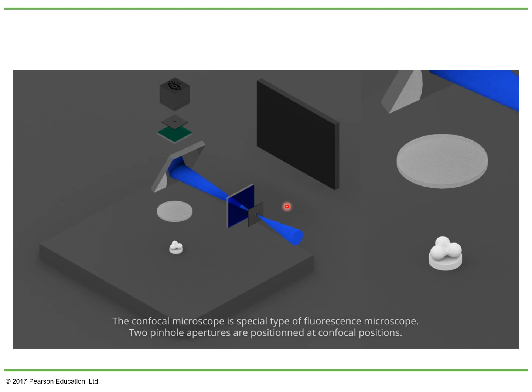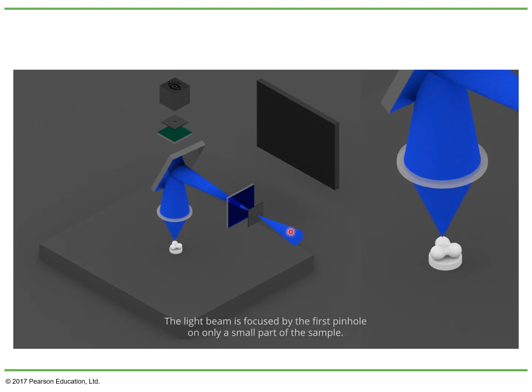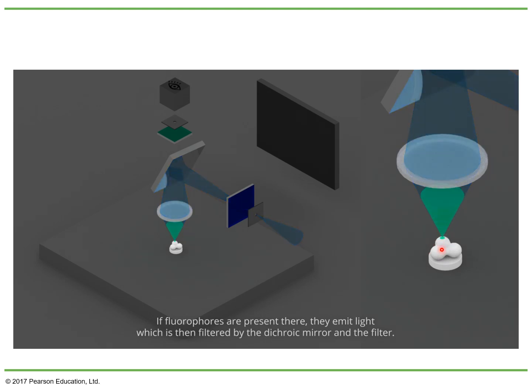A confocal microscope is slightly different. Although it will have a laser, it will have different filters and different pinholes, so you don't illuminate the entire sample, you illuminate only a section. You're not illuminating the three cells, you're illuminating only a specific section of the sample.